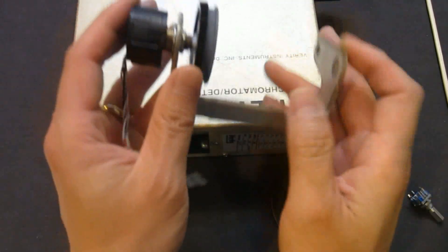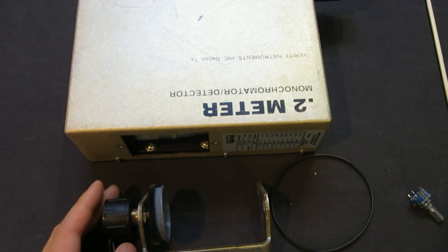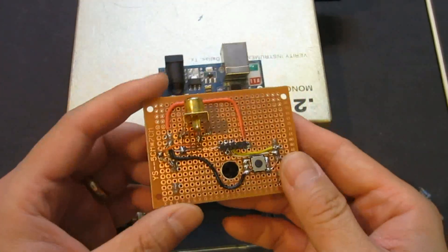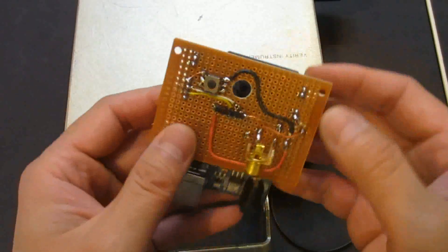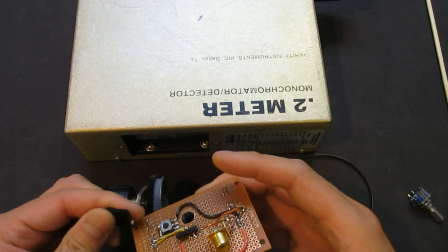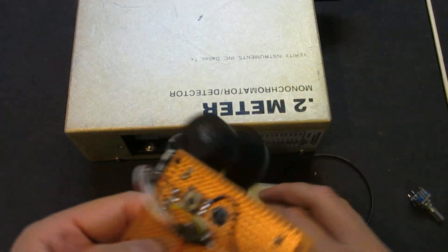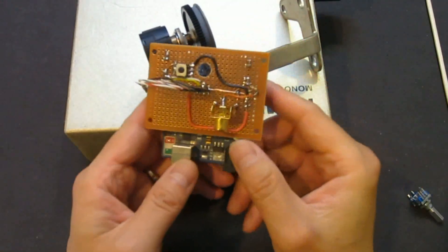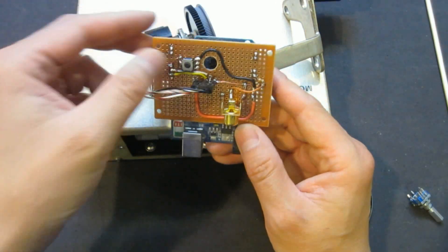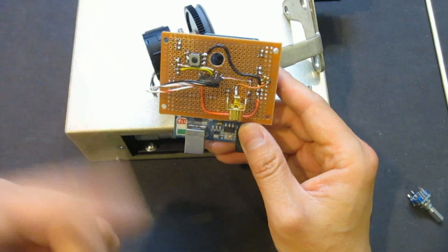This one will do the job quite well. In order to use it, I made a simple shield on top of an Arduino. The pins here are used so I can plug in my encoder. I also have this button — the idea is that after I've dialed the full turn, I press this button to stop the operation.